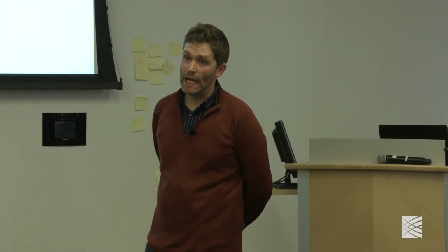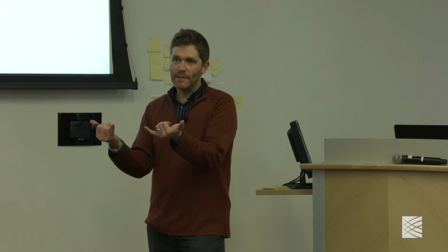So if you had whole genome and whole exome data, which would you use for copy number? Is one more preferable than the other for calling copy number? It depends what I'm doing, but first of all, they're not going to be covered to the same depth.